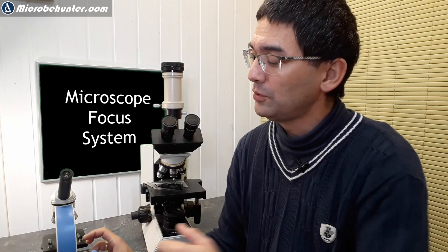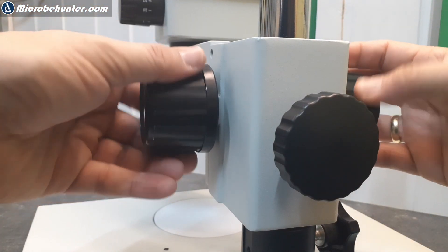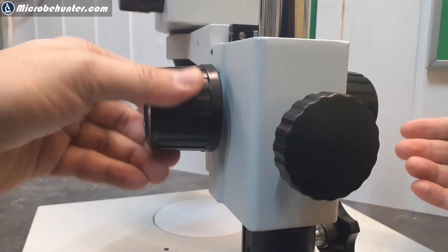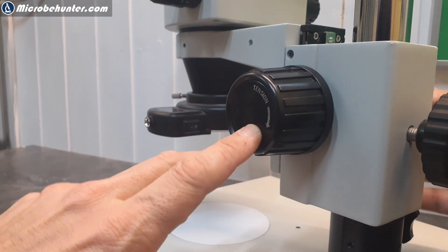Another reason is that on some microscopes, especially some stereo microscopes, you need two focusing knobs because when you rotate them against each other you can adjust the tension of the stage. It's very important to be careful here, because not all microscopes allow you to do that. I once physically broke a microscope — I thought you could tighten it by rotating the knobs against each other, and something snapped.